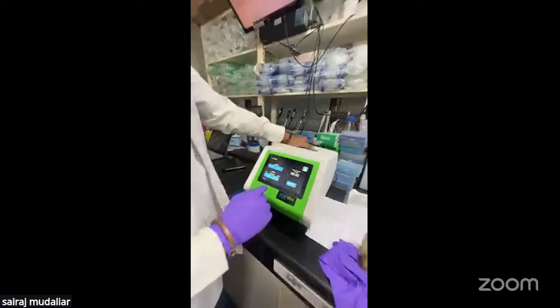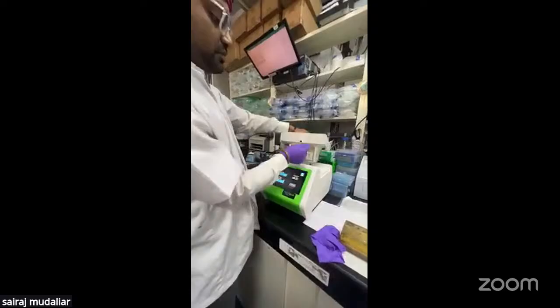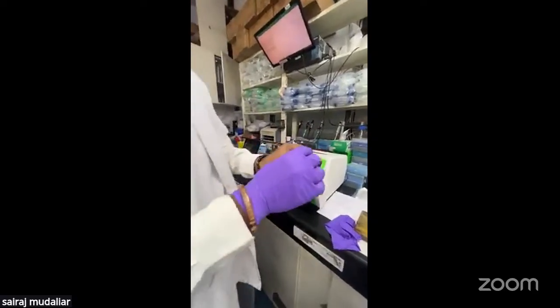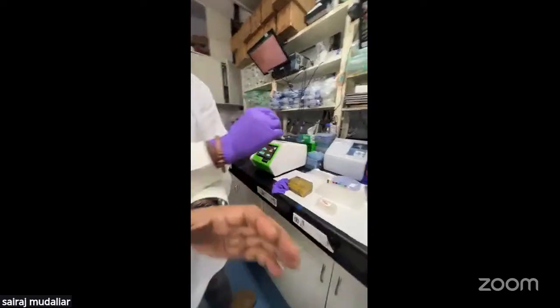So once your tissue is lysed, now the main thing is the digestion. We will show how the proteomics digestion happens. So I will request Khushi, my TA.